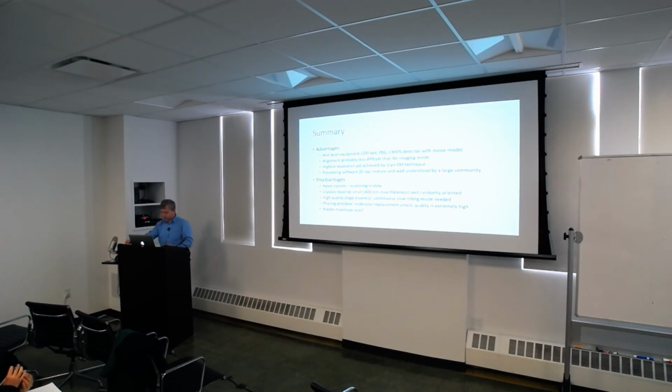The phasing problem basically is right now molecular replacement, unless the quality is extremely high and you can do some sort of ab initio method. But again, hopefully that is the future, that you could do some more clever imaging and get phasing from that.